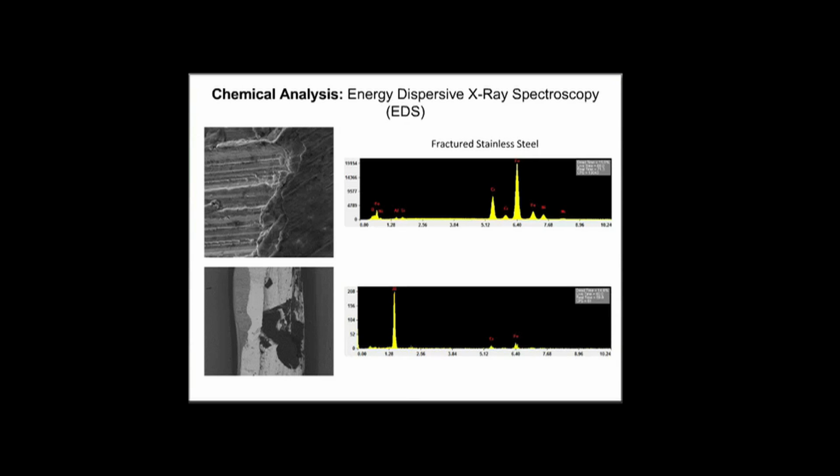And so one thing that I didn't mention is this was an aluminum coated stainless steel sample, and when it broke, little flakes got into that, and you couldn't really tell until you went under the microscope, or you weren't able to notice that. So when I talk about students sending in samples, maybe you're doing a type of research experiment, and we've had some students send in samples and looking at how well they may have fabricated something, and maybe why something looks different or acts different, and so they send in their samples and then spend some time studying that.